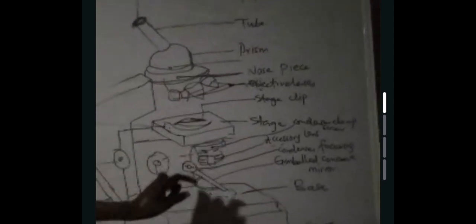This is the condenser. There is a screw here too. These are the significant things. Let us note them: the eyepiece, the tube, the prism, the nose piece, the objective lens, the base, the stage, the mirror. The focus: we have the coarse focus control and the fine focus control. This is the arm or the limb of the microscope.